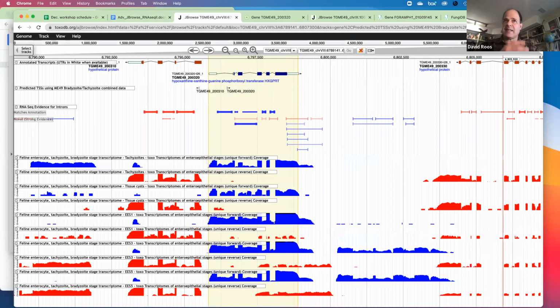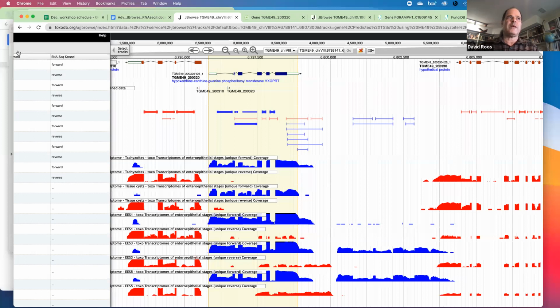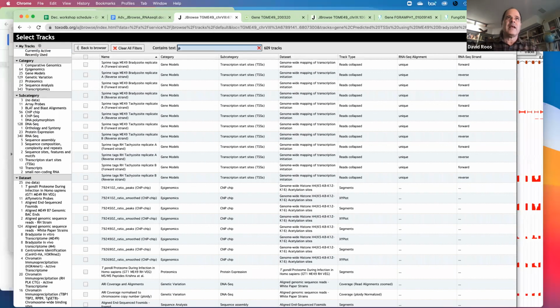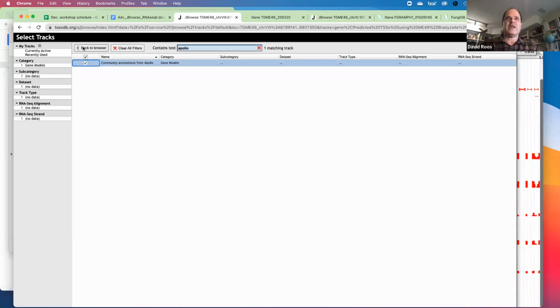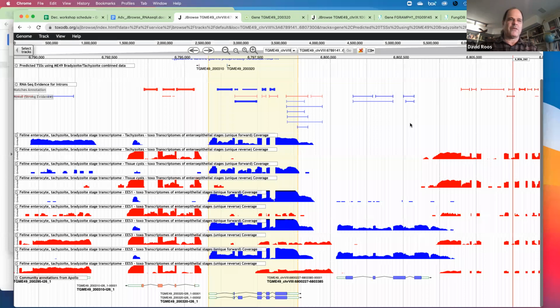But let me just close by commenting that once this information is known, it can be incorporated into the annotation in a resource that we won't have a chance to talk about today, in the Apollo Genome browser. And over the coming months, you can look for opportunities to add your own information, as has already been added here. So looking at community annotations from experts in the community, in this case, entered by our expert curator and annotator, Uli Boehm, who some of you will be fortunate enough to encounter in one of the breakout sessions.